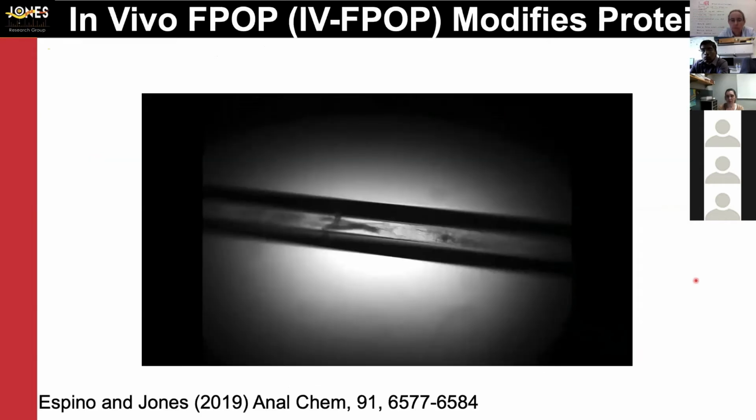We did have to, of course, work on the flow system here, which my grad student worked really hard on to get the worms to flow. When you're dealing with a live animal, this was difficult. This was even an initial one where we got clumping. She was able to remove this clumping, and we get one worm flowing at a time.